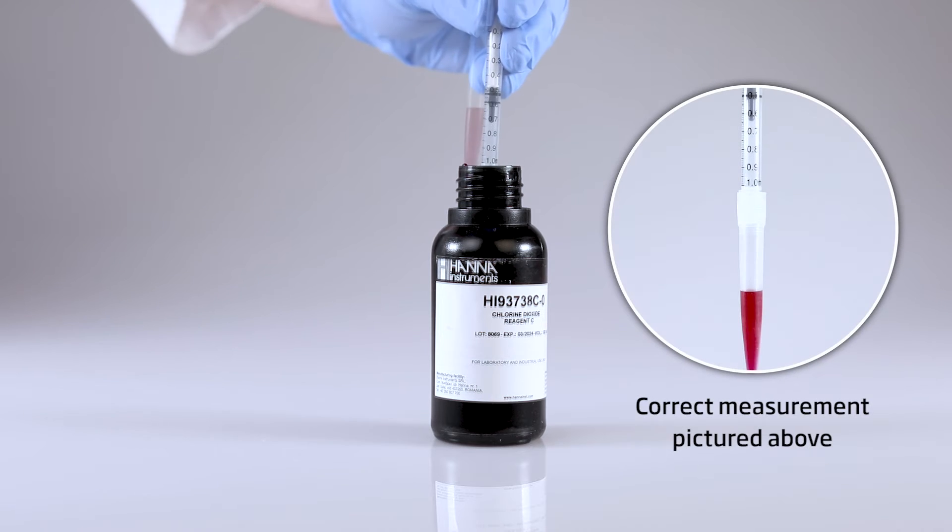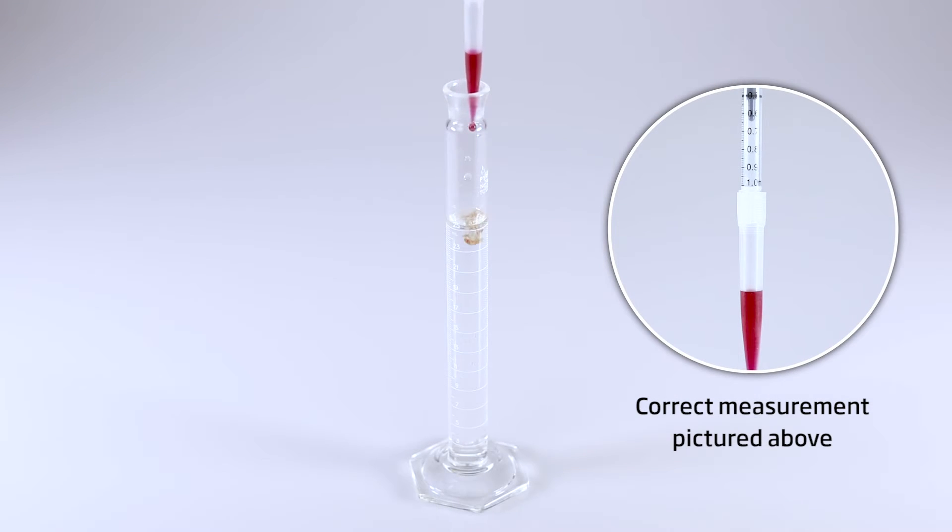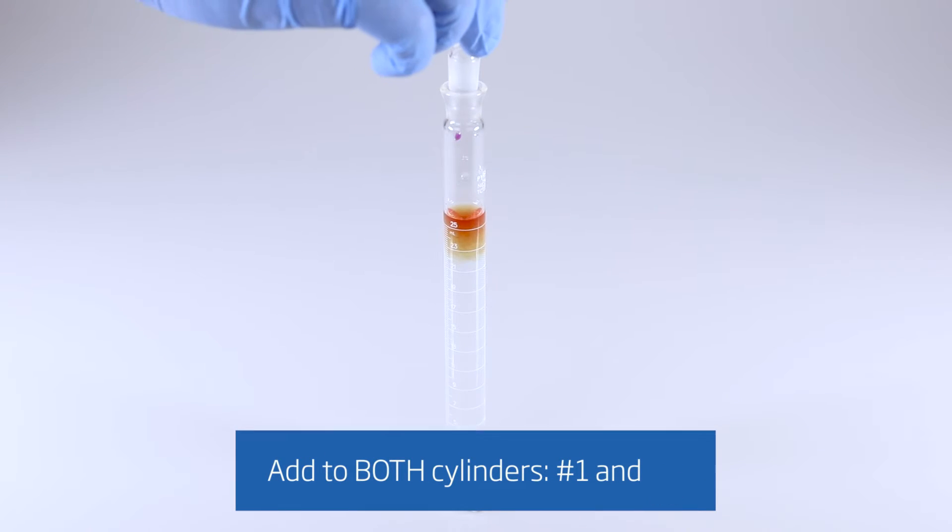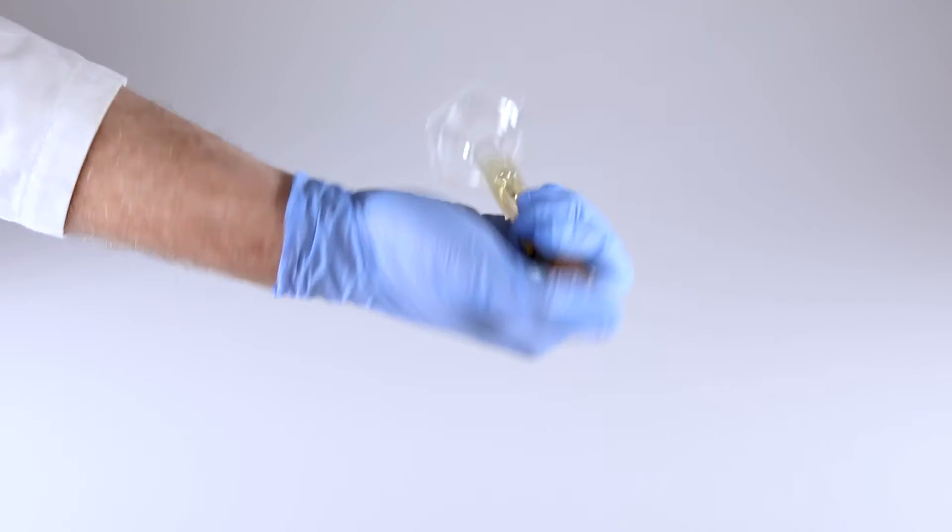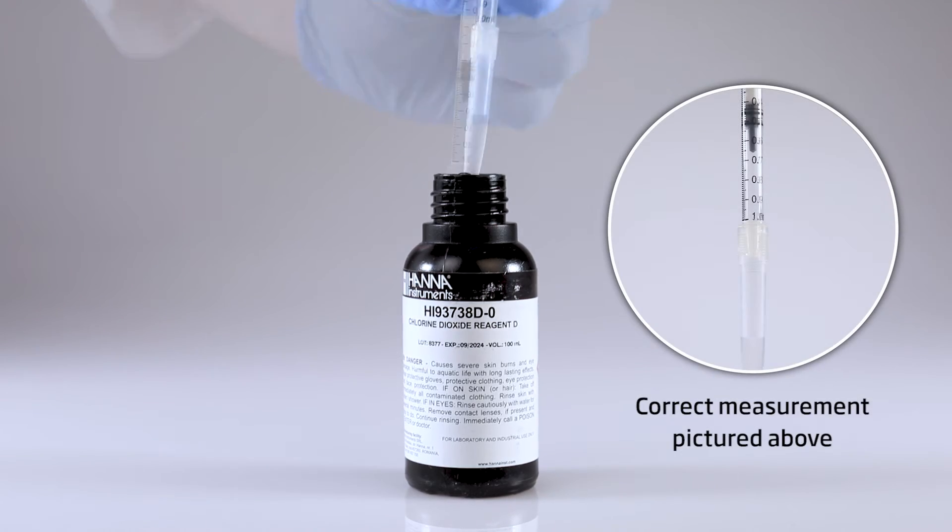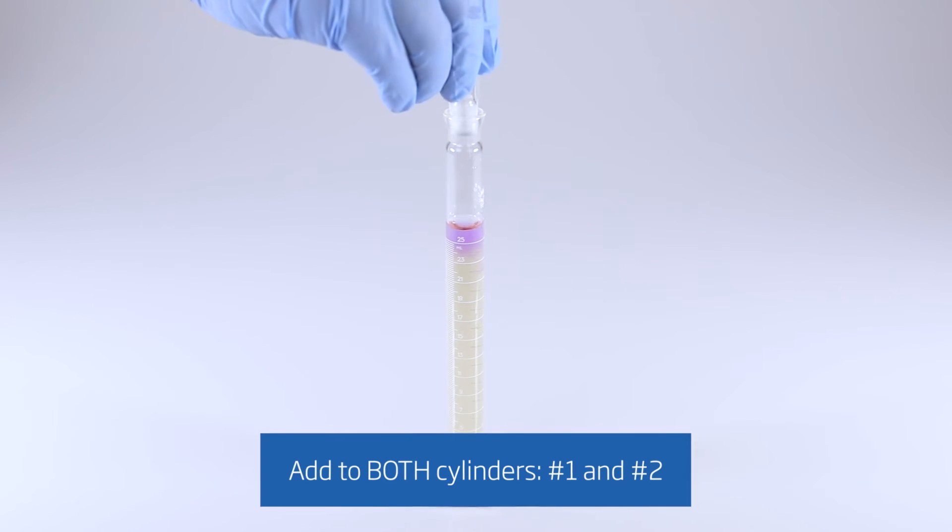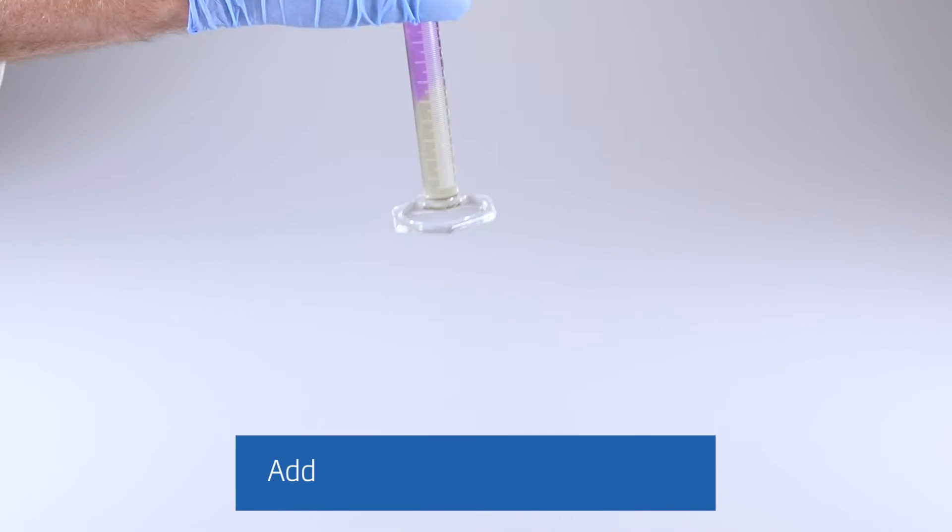Next, using a different syringe, add 0.5 milliliters of reagent C to each cylinder. Cap the cylinders and invert several times to mix. After that, take your final syringe and add 0.5 milliliters of reagent D to each cylinder. Cap the cylinders and invert several times to mix.